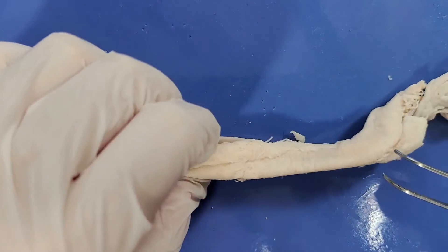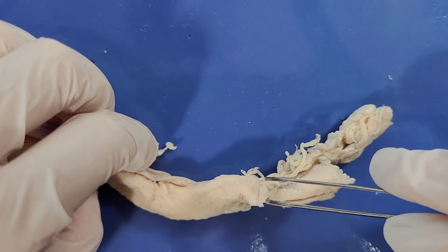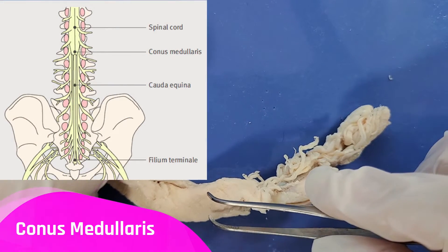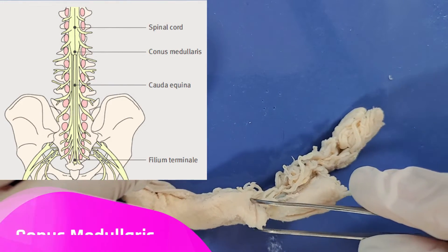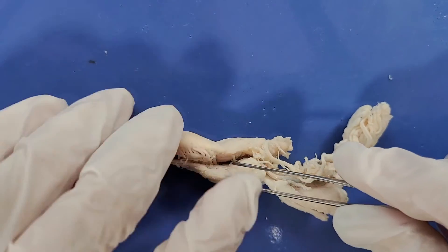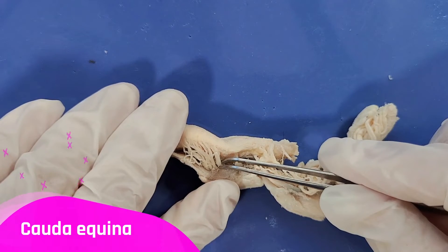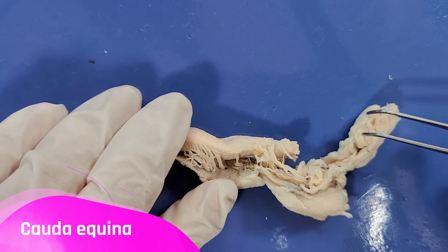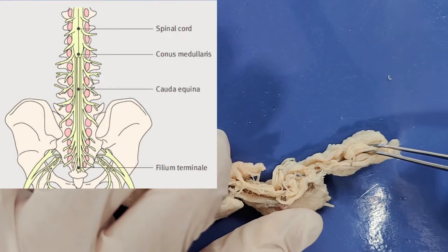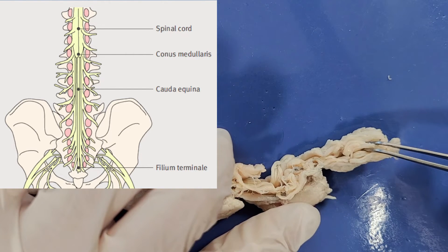Now at the lower end of the spinal cord you can see that it tapers off in this triangular shape. This is called the conus medullaris, and below that are these bundles of spinal nerves — you can see them if I tilt it right here — and these are called the cauda equina. You can see more of them around here. Cauda equina means 'horse's tail' in Latin, and these nerves kind of look like a horse's tail.